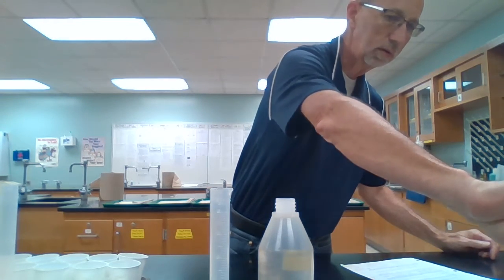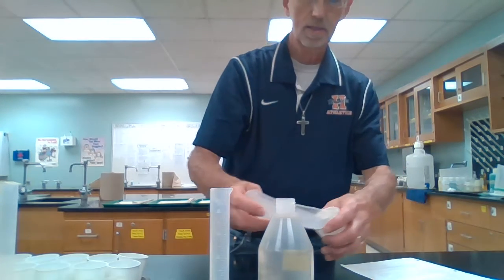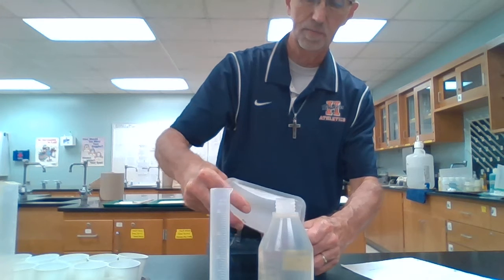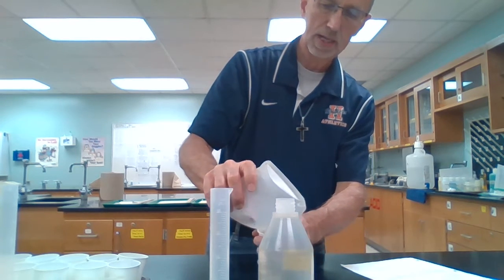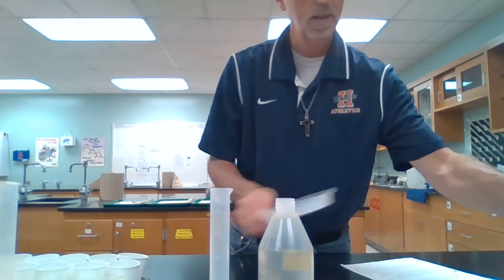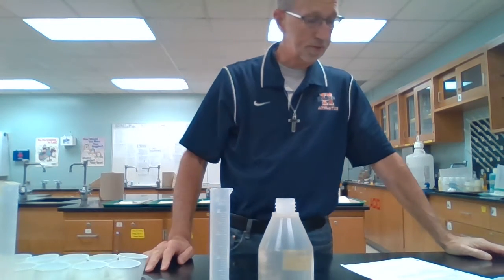There you go. 64.96 grams. So get all these pieces back in the cup here without spilling them all over the place. Come on, I got one straggler there. You don't want out of there. There we go. Okay. So that takes care of the masses of our copper samples 1 through 6.